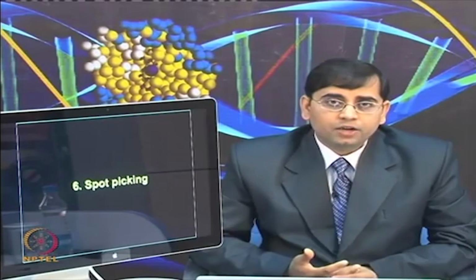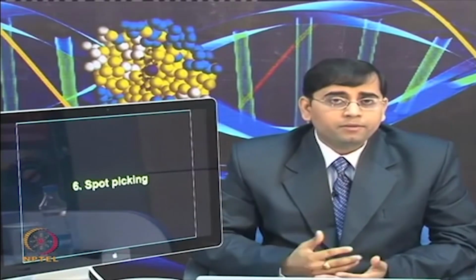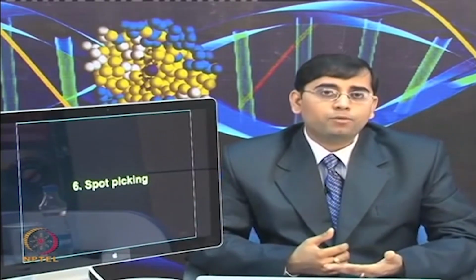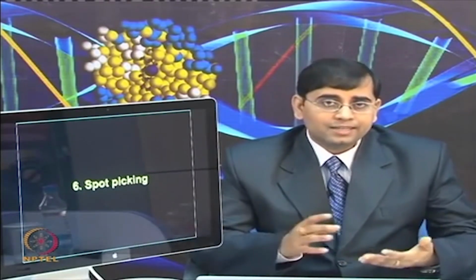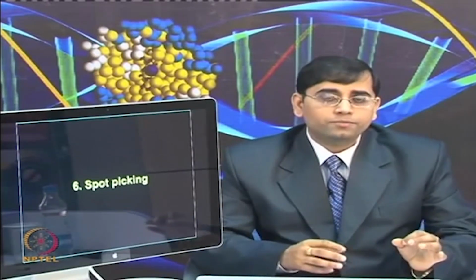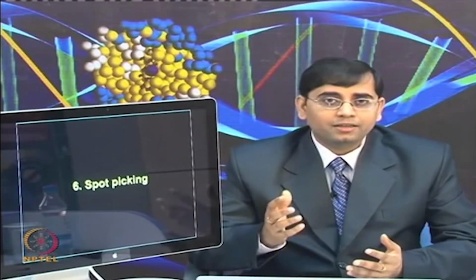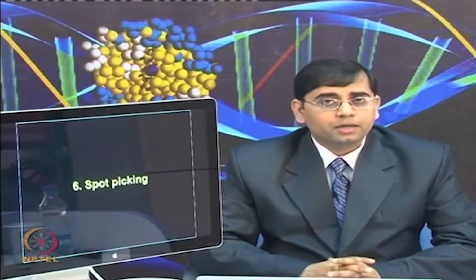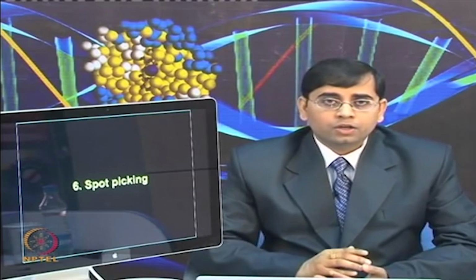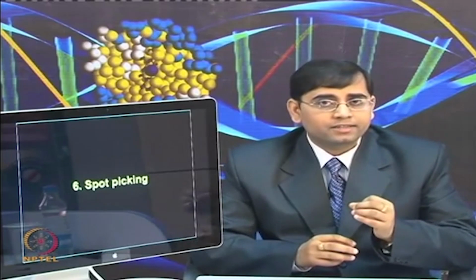So, if you have a small number of protein spots, it is very easy to excise the spots from the gel even manually. If you print the spot map or the 2D gel image and keep it side by side with your gel, it is easy and possible to locate those spots on the gel and excise them manually. You obviously have to ensure various quality control checks to avoid any contamination, but that can be done. The other way is to use a robot picker and excise the spots of interest. That is more precise, but more costly.